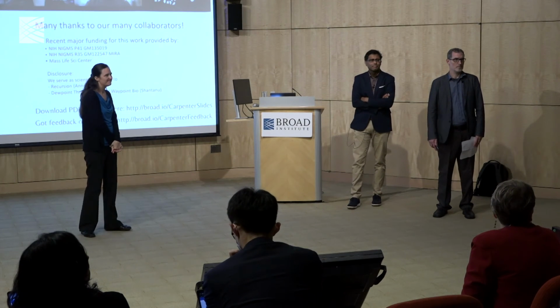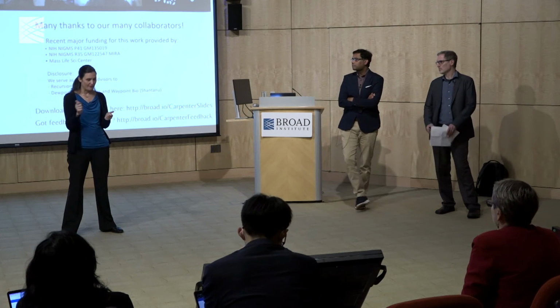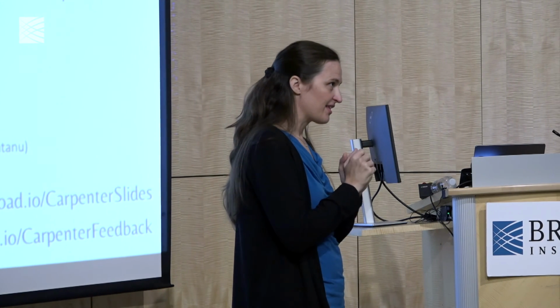Really fascinating topic. You showed Angelman syndrome, Noonan syndrome down versus normal phenotype. Assuming you're able to reverse the phenotype in cells with some chemicals, would that lead to possibly reversing the phenotype in biological organisms? That's the hope, yes. So the hope is that any compound where we find a cell-based phenotype and reverse it, the disease is cured or treated. Do you have an example of this where you're getting close?